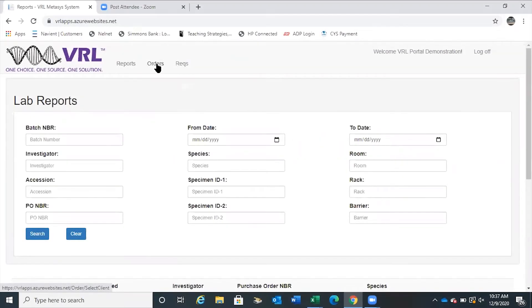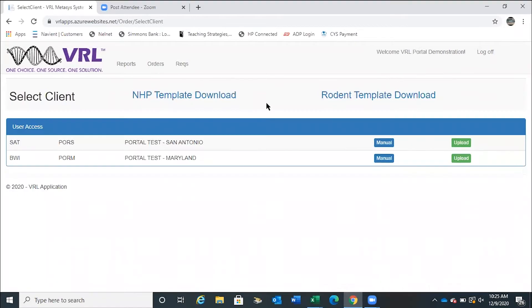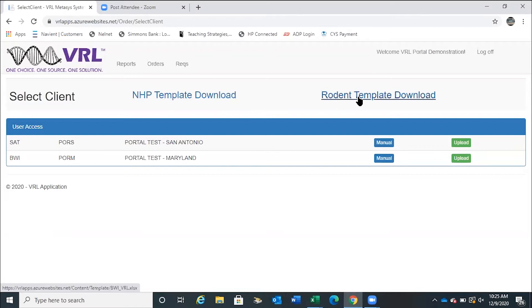There are three ways to order: template upload, manual, or paper. Once you are in the VRL Portal, go to Orders. After logging into the VRL Order Portal, blank templates for the ordering spreadsheet are accessible — this is the simplest way to begin inputting large amounts of data. There's an NHP template, as well as a small animal or rodent template.